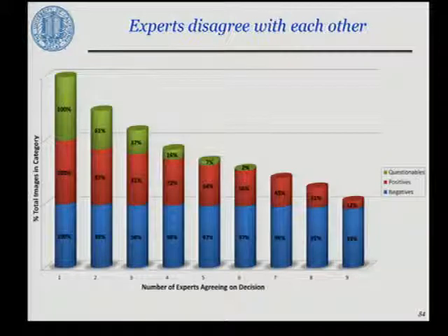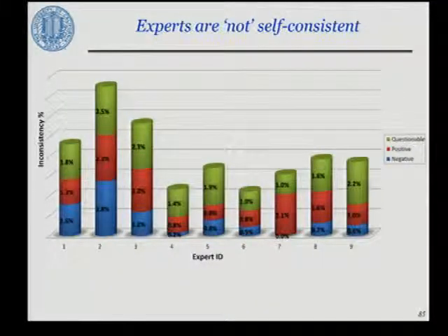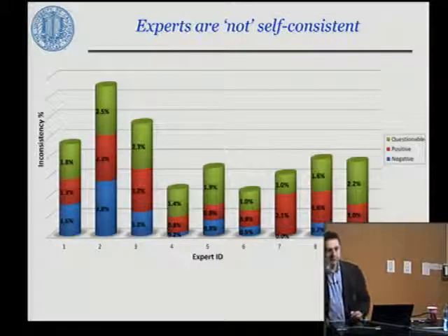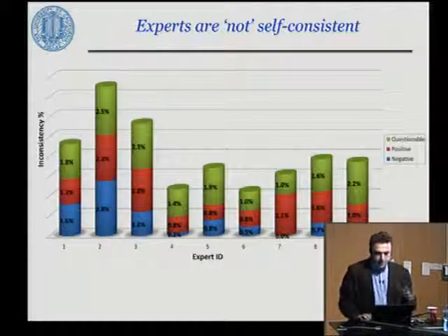Later on, after the undergraduate test phase, we took this platform to experts, to professors who make a living out of malaria diagnosis. One thing that we have observed is that experts disagree with essentially their colleagues. There's a lot of disagreement on what they see, positive or negative. And they also are not self-consistent. We've given the same expert the same image 3 times by rotating it. After a few hundred other images in between, they were not self-consistent always in their own decisions.